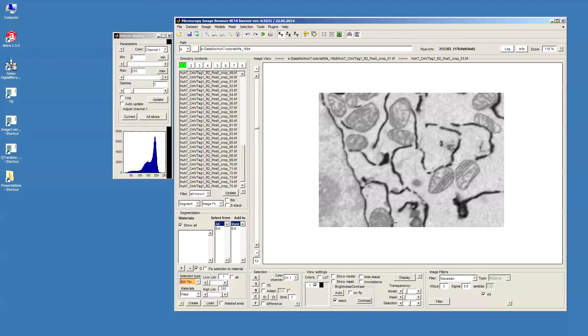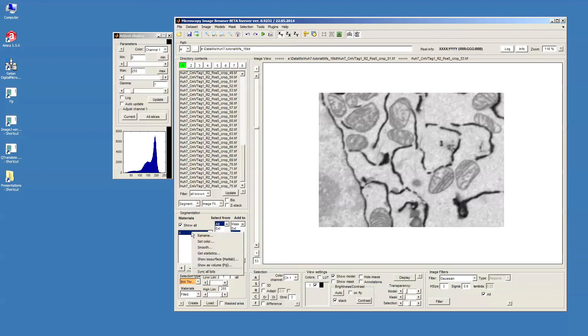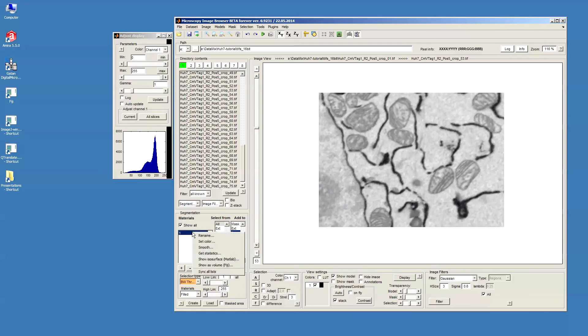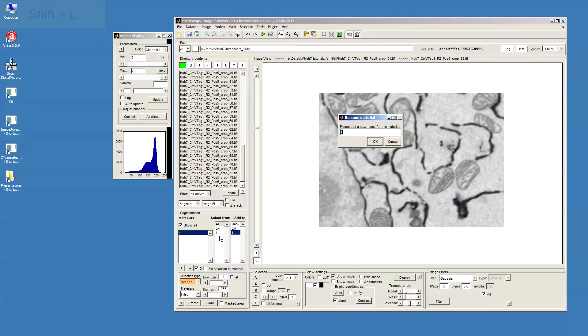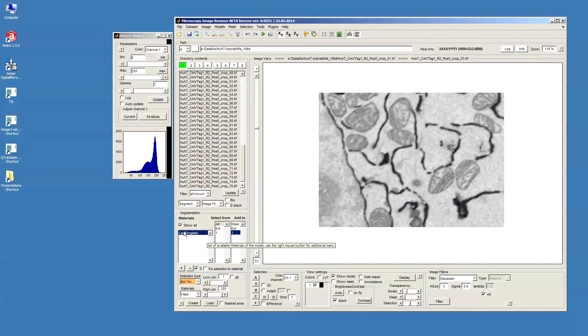So, let's start with the lipid droplets. In order to start the model we need to press the create button in the segmentation panel in the left lower corner. This allocates space in memory for the model. Then we press the plus button to add material to the model. The first material we can select with the mouse button, then press the right mouse button to call the pop-up menu and select name, and I can name it as lipid droplets. This is going to be our first material.